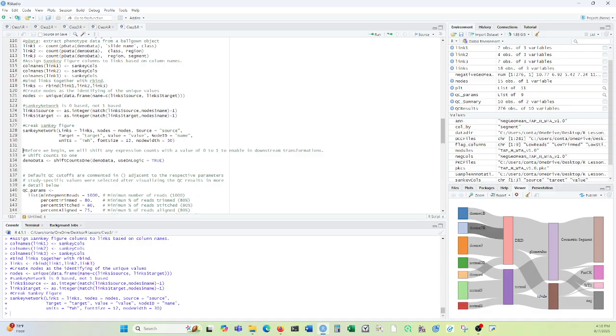Disease 1, 2, 3, 2, 4, and then see how they actually interact. So that's cool. Cool little representation of the phenotype and the genetic, like the result.